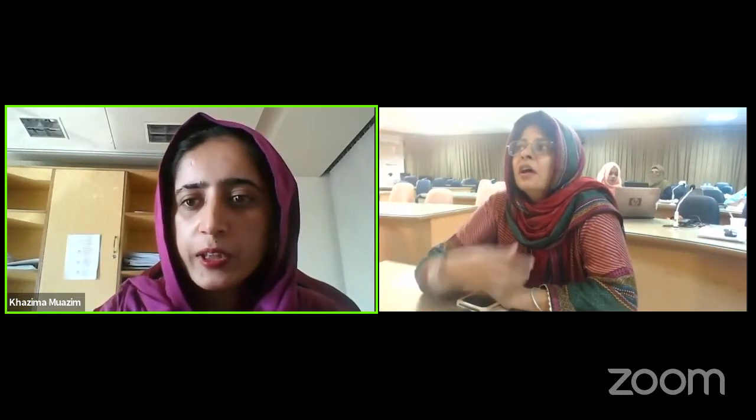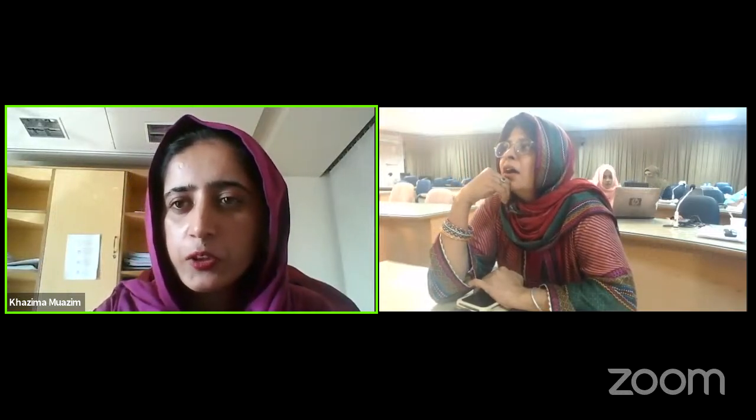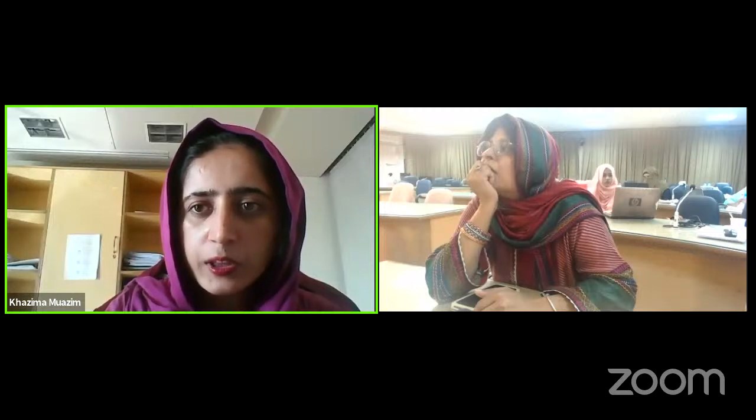Okay, thank you, Fahida. So let me ask one more question. This is from Salman Kashmiri. Do we have to keep vacuum in the UV chamber? So any one of you from the ICCBS team can answer him.